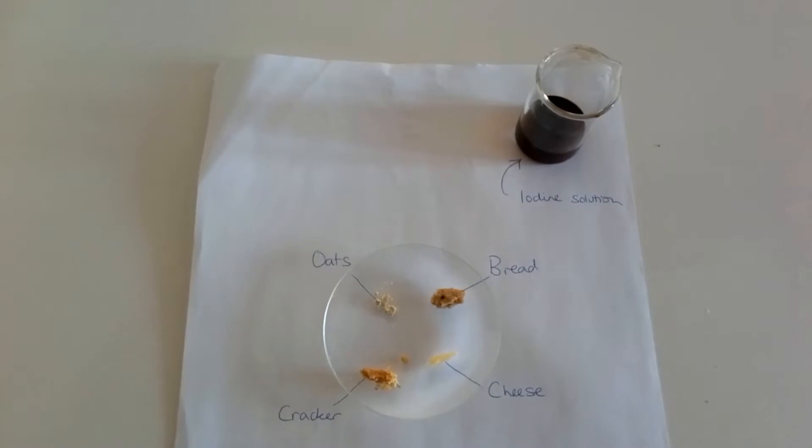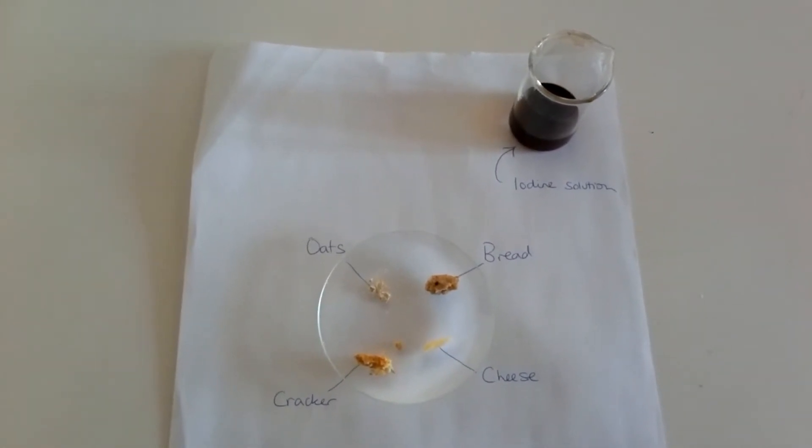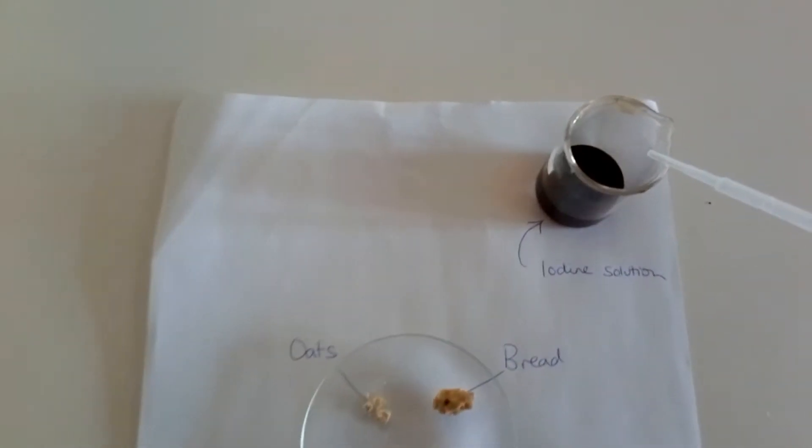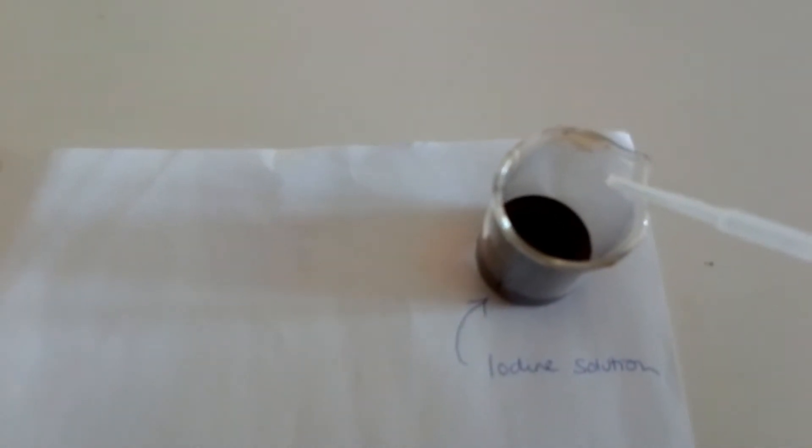So first of all let's remind ourselves about the iodine test for starch. In the beaker here we have some iodine solution which is an orange brown solution.